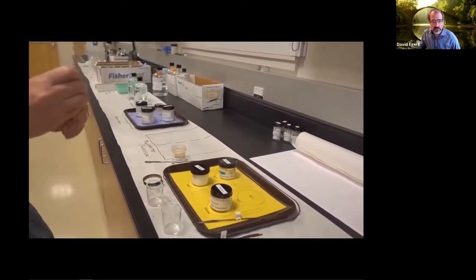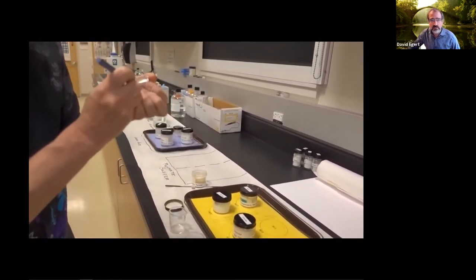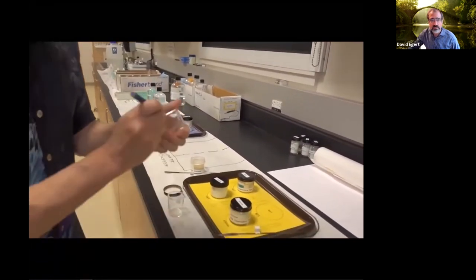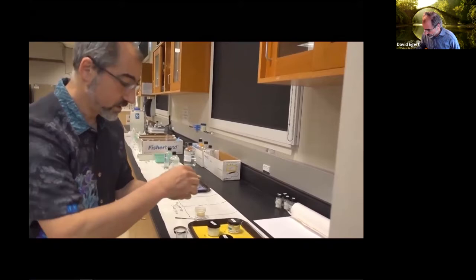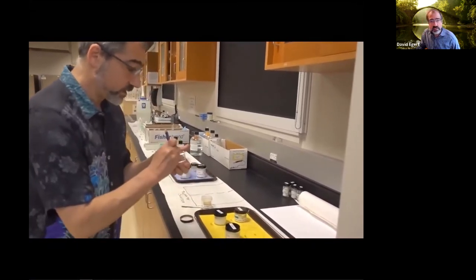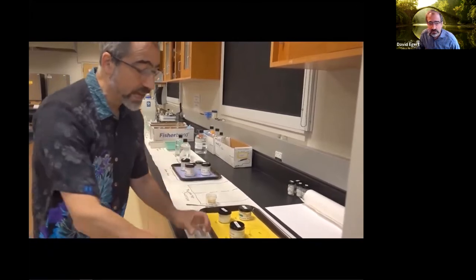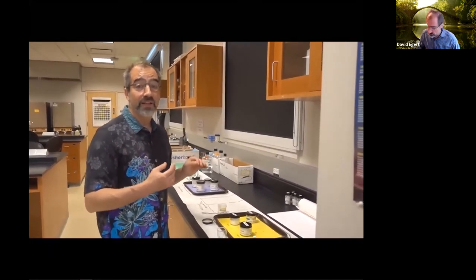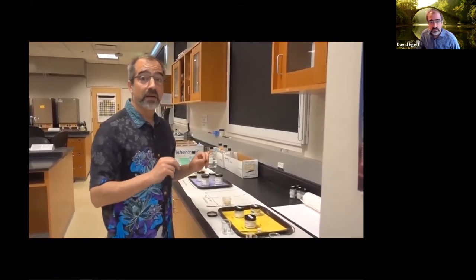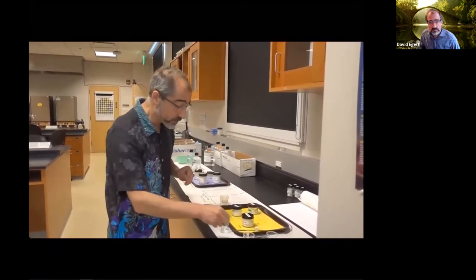So I'm going to use a pencil here, and I'm going to have some potassium chloride, calcium chloride, and sodium chloride. That's another thing. In a lot of these labs, you're going to have very similar looking tubes or beakers, but with different stuff. It's another place where you want to get pedantic and be good about your record keeping and marking what's what so you don't get confused about things.